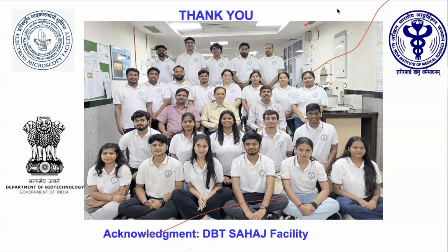Are all of the facilities available now for use by the community? Yeah, it's open. Mostly for cryo lamella preparations and slice and view for plunge-frozen samples. For room temperature, slice and view is open. We are only struggling with high-pressure frozen tissue samples, because we figured out that the problem might be with our high-pressure freezing, not with the equipment. So we were just sorting out how to fix that.